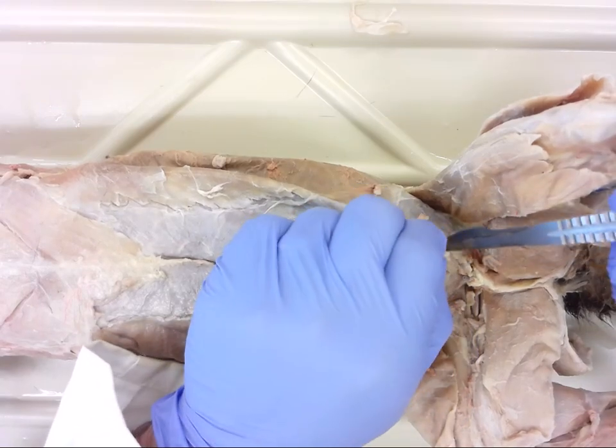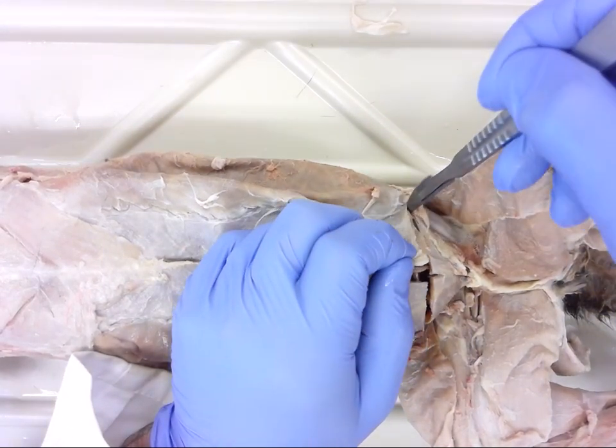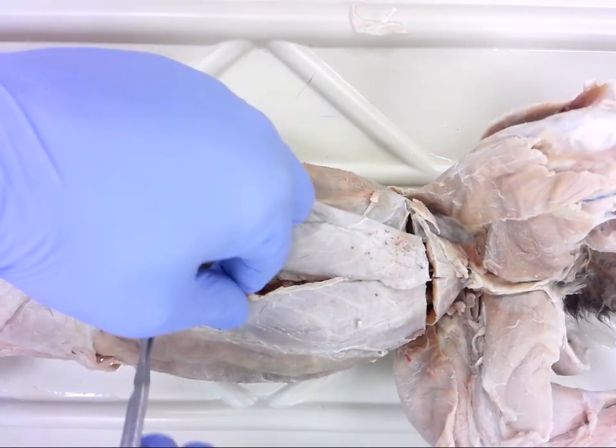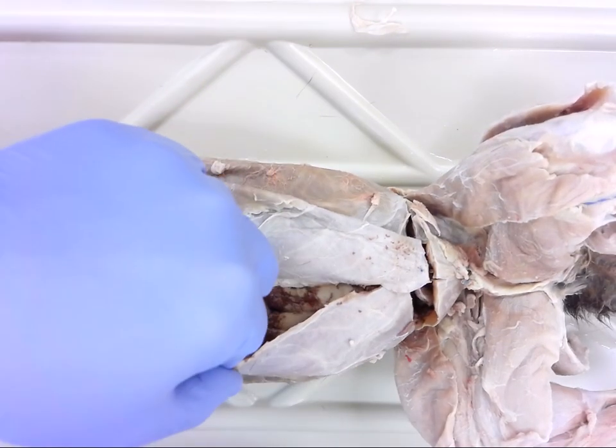Now, as we get in here, you're going to notice that right on top of the abdominal contents, you have a membrane. And this membrane is called the greater omentum. Now, when we look into this, I'll make another incision along the top.